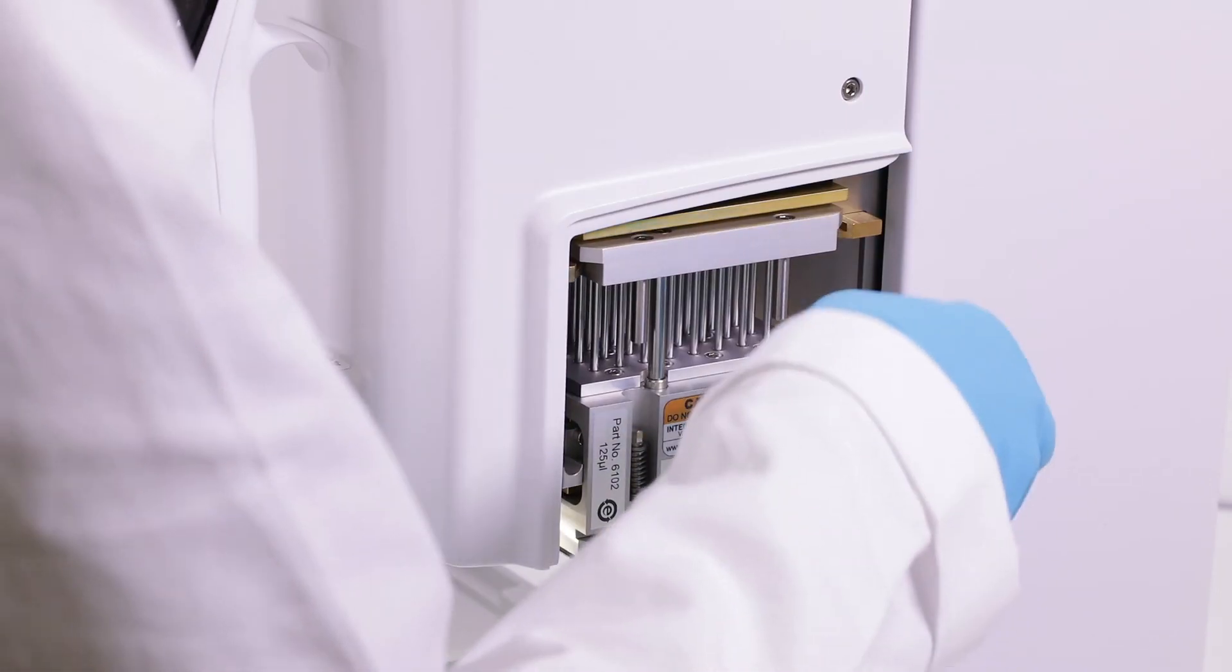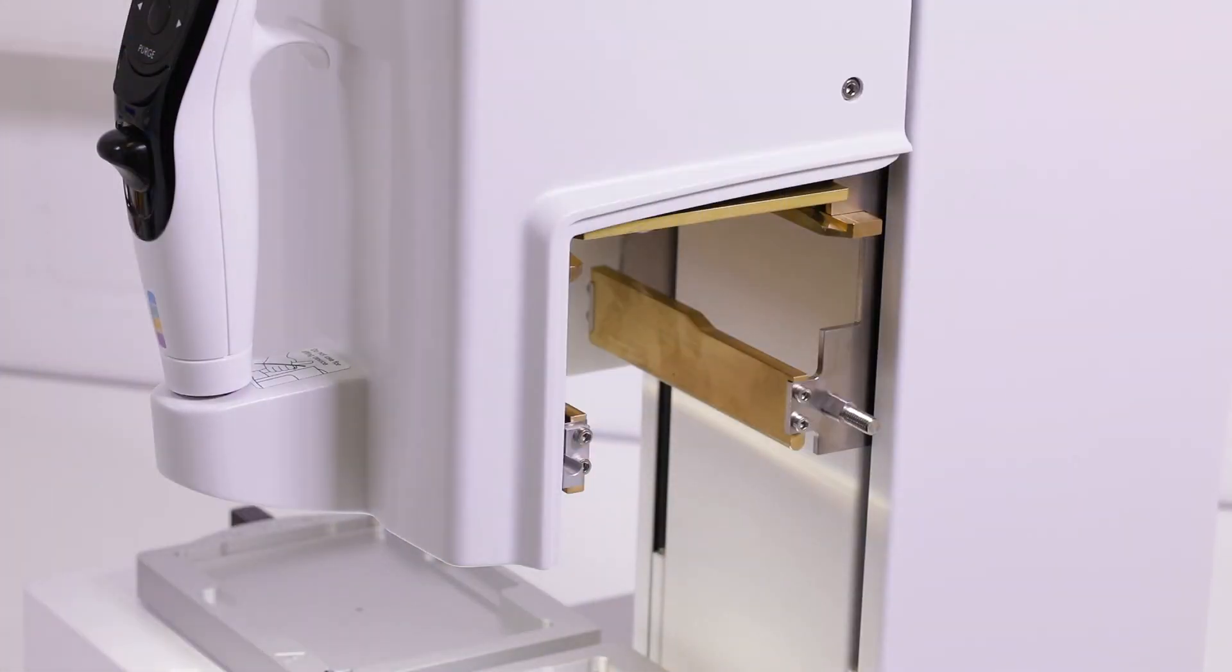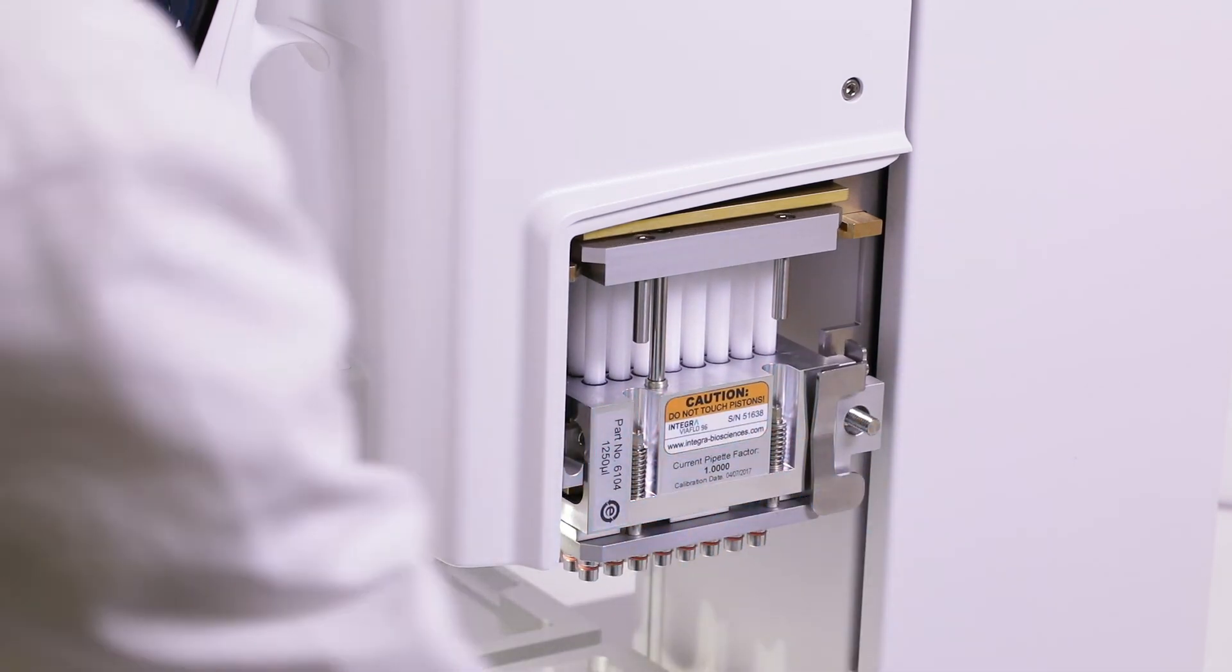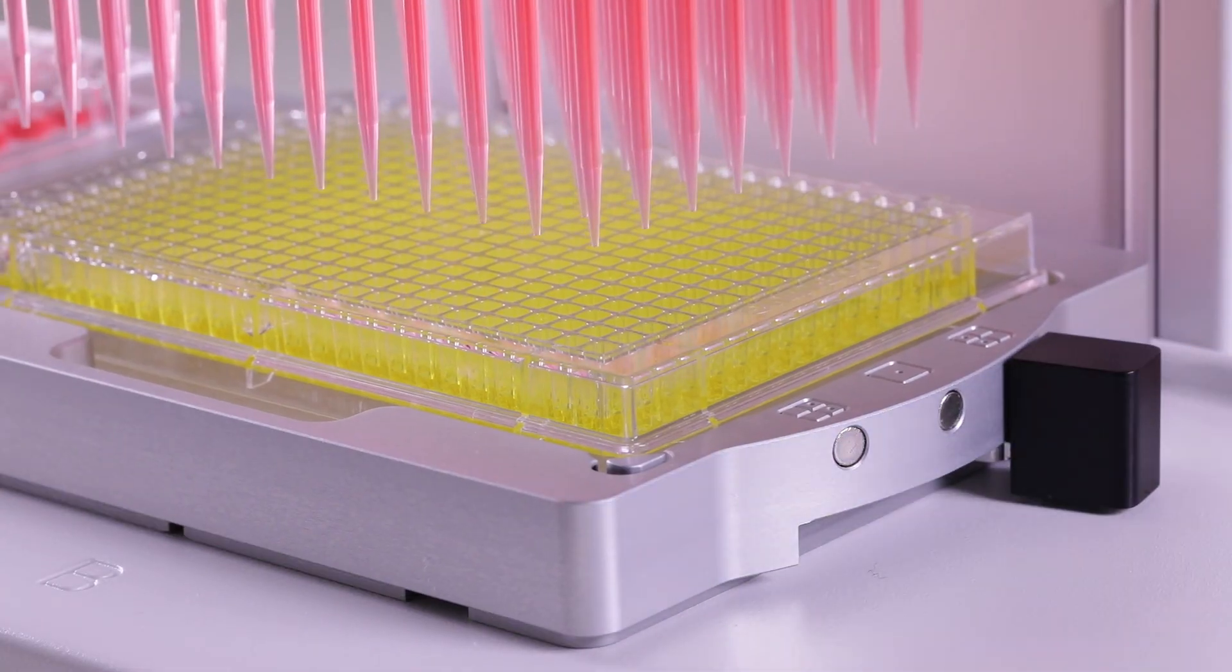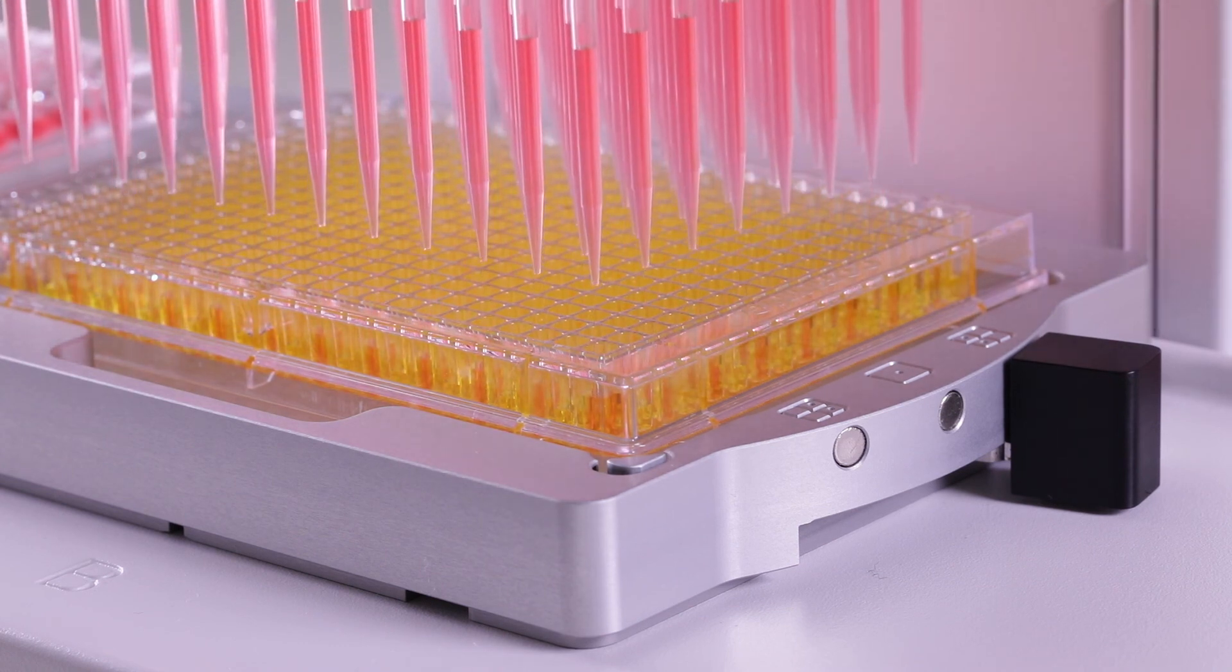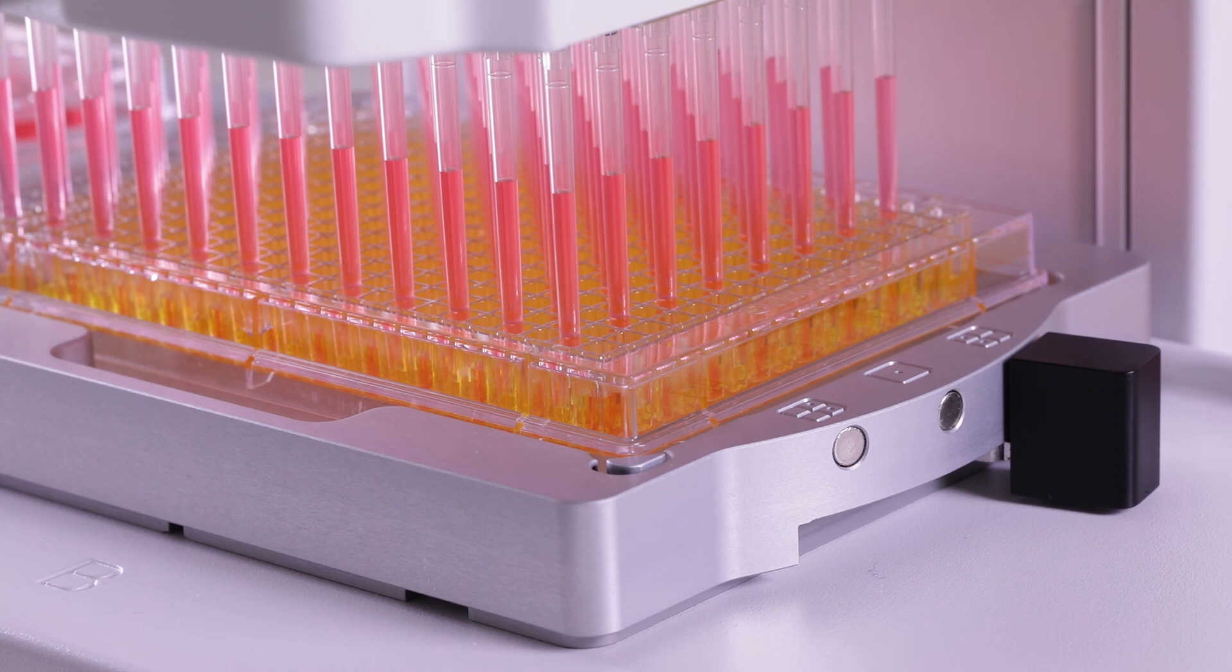Thanks to the exchangeable pipetting heads, you're always working in the optimal volume range, for best accuracy and precision. Pipetting 24, 96 or 384 samples with the push of a button, bring your pipetting productivity to a whole new level.